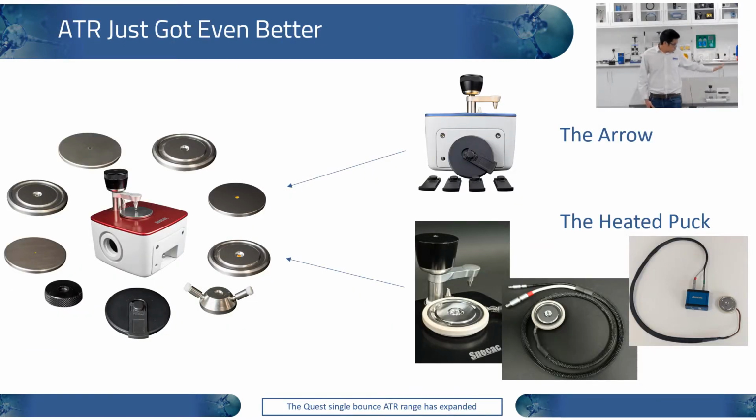So now we've just finished talking about using the Pearl accessory for liquid transmission analyses. We'll now move on to the Quest, used for single bounce ATR analyses.